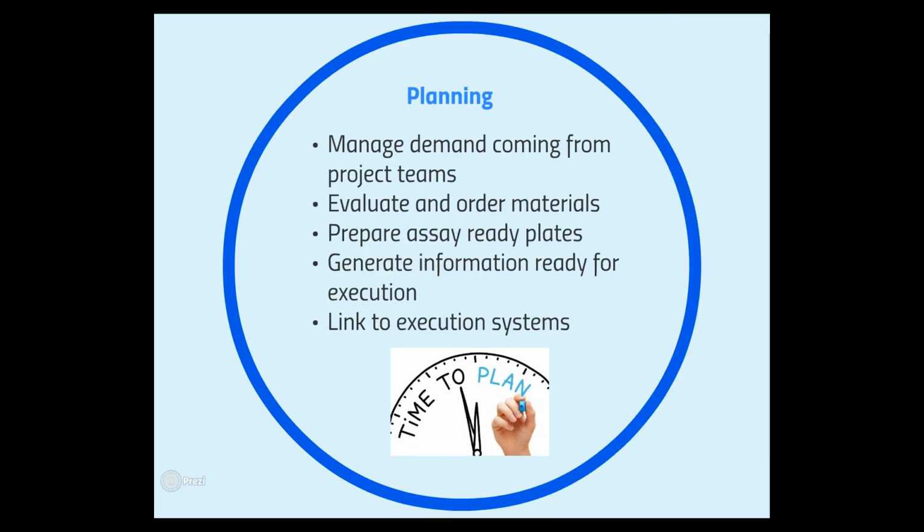It's also there to support you with planning as well. So we want to manage the demand coming from project teams and then distribute that work across the delivery teams and external organizations as most appropriate to optimize throughput. So we're going to evaluate and order materials. So it could be biologic samples coming from the inventory system or small molecule samples coming out of compound management.